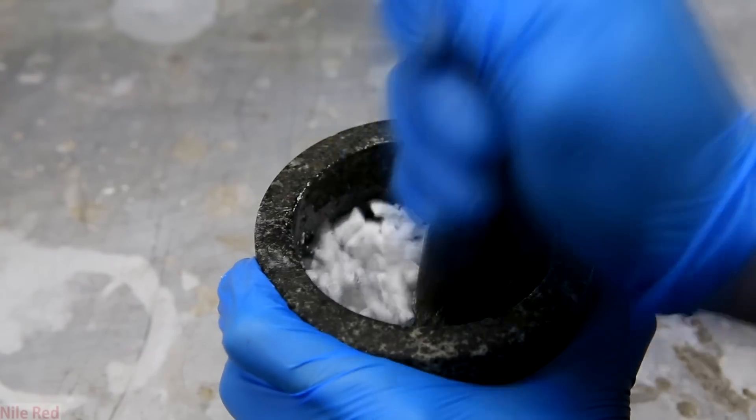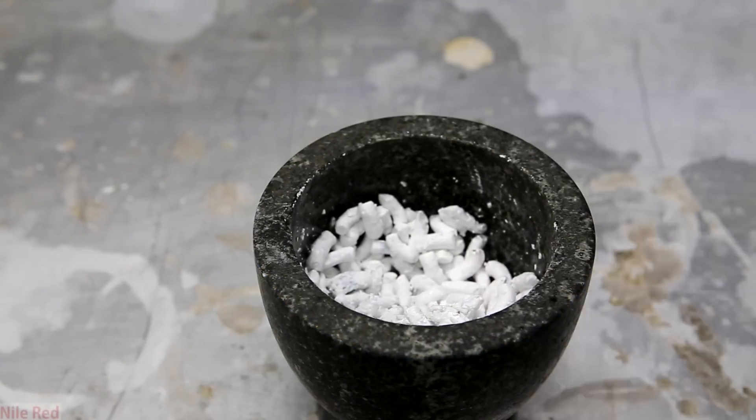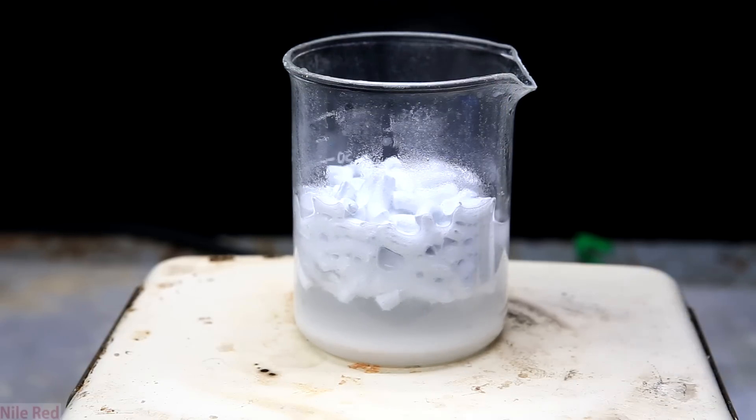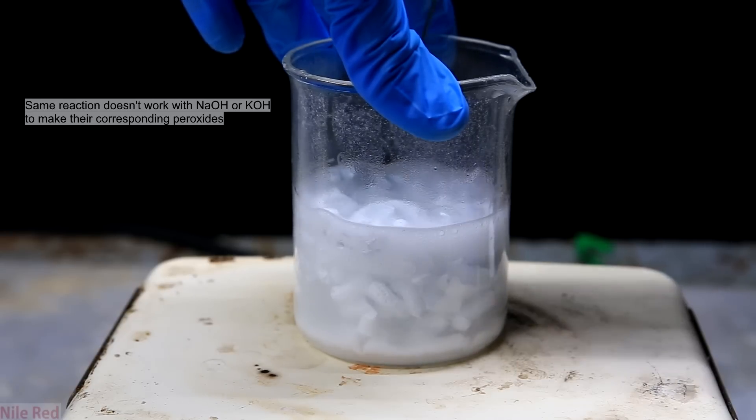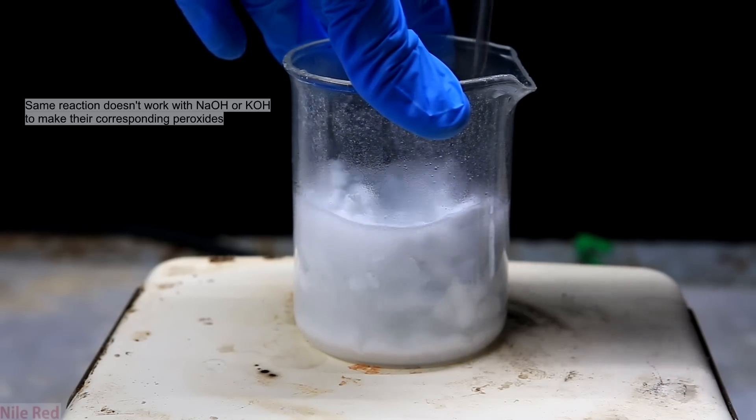To take this one step further though, the lithium hydroxide can act as a precursor to something called lithium peroxide. The peroxide can be pretty easily made by reacting the lithium hydroxide with some hydrogen peroxide.